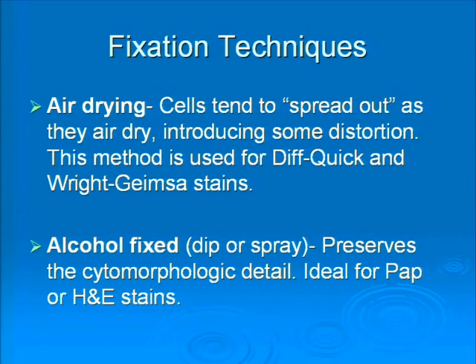If you have looked at reports that come back and say air drying artifact or something like that on the report, that's the ones that go with this second one, the alcohol-fixed slides. If they don't get into the alcohol immediately, the edges of the smears start to air dry, and that's when you're getting the comment of air dry artifact. The first kind that we stain in clinic, the Diff-Quik kind, those you want air dried. You're never going to get a comment like that. That's the whole purpose of those.